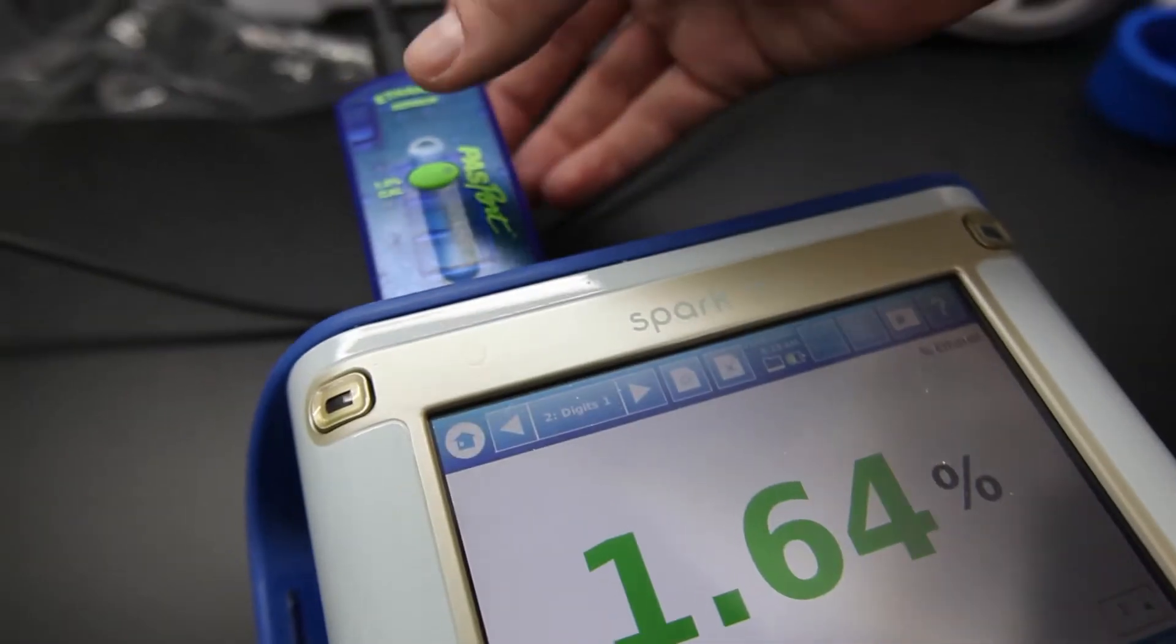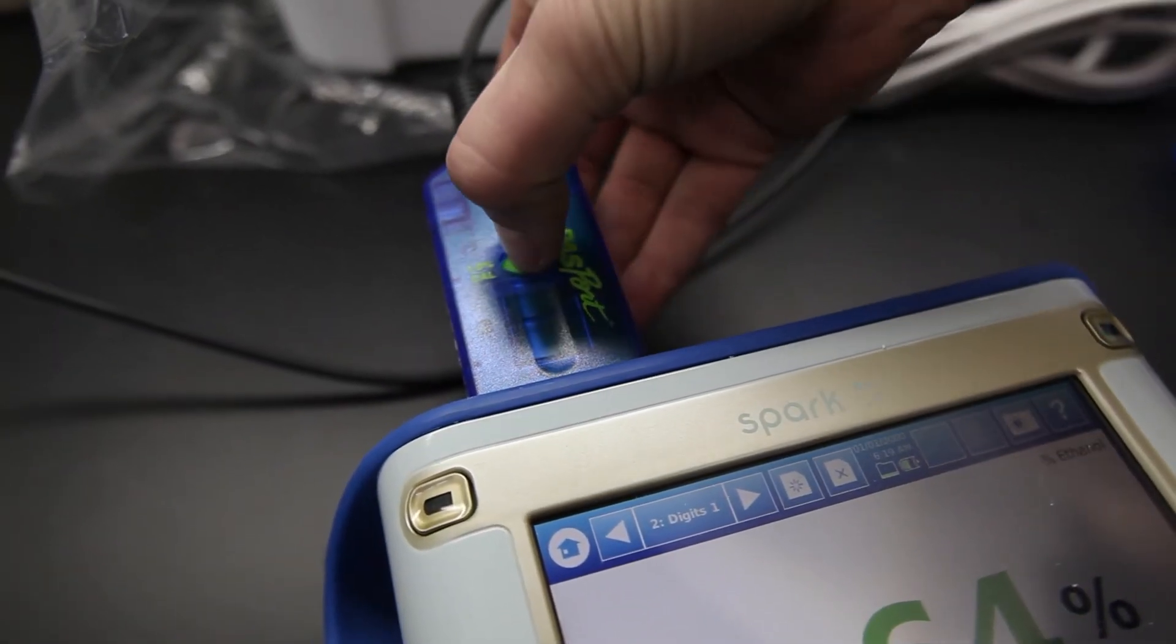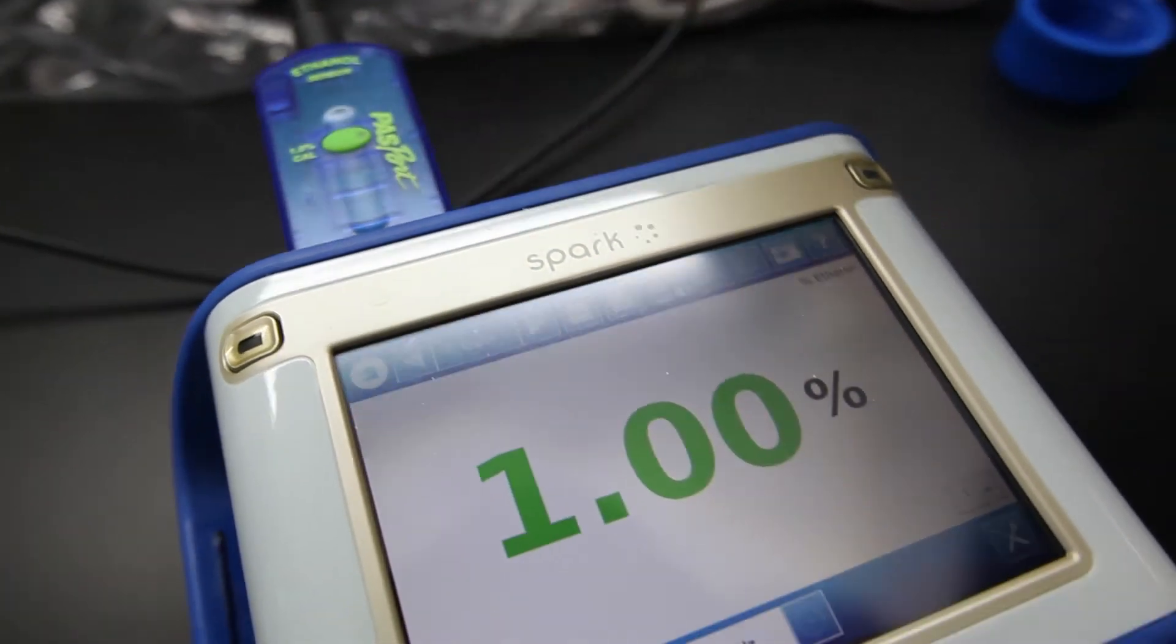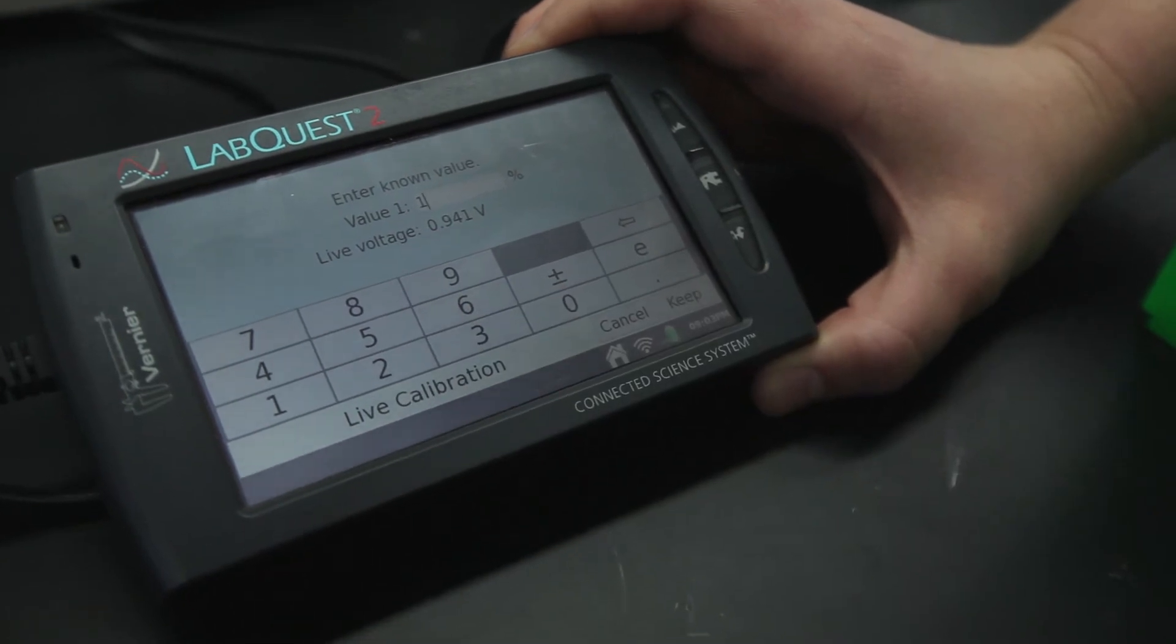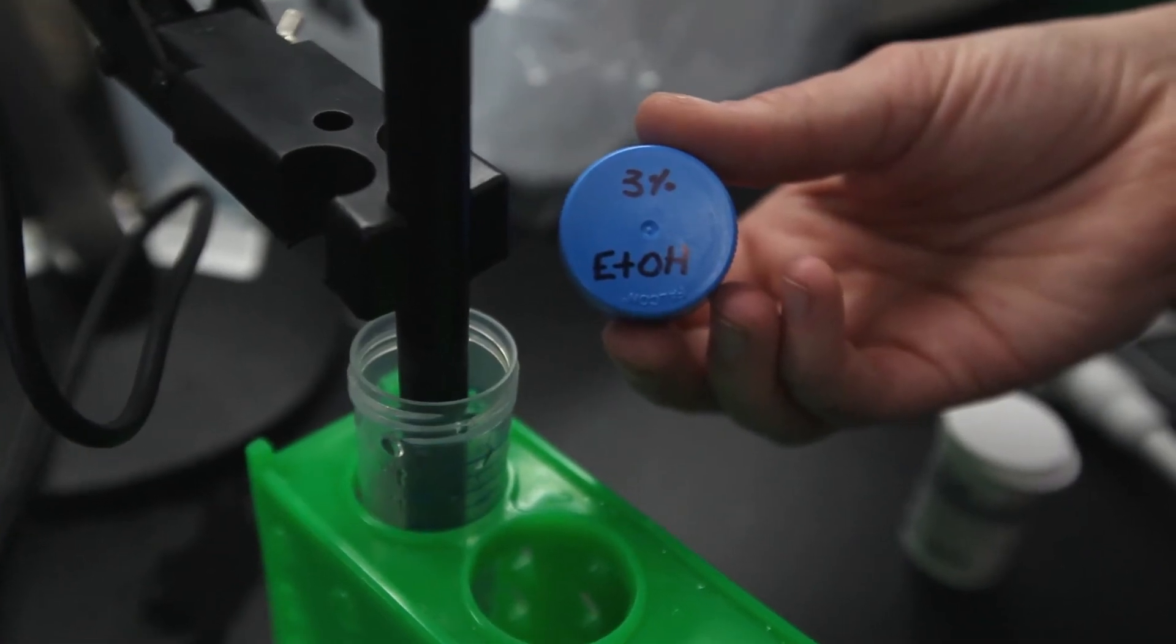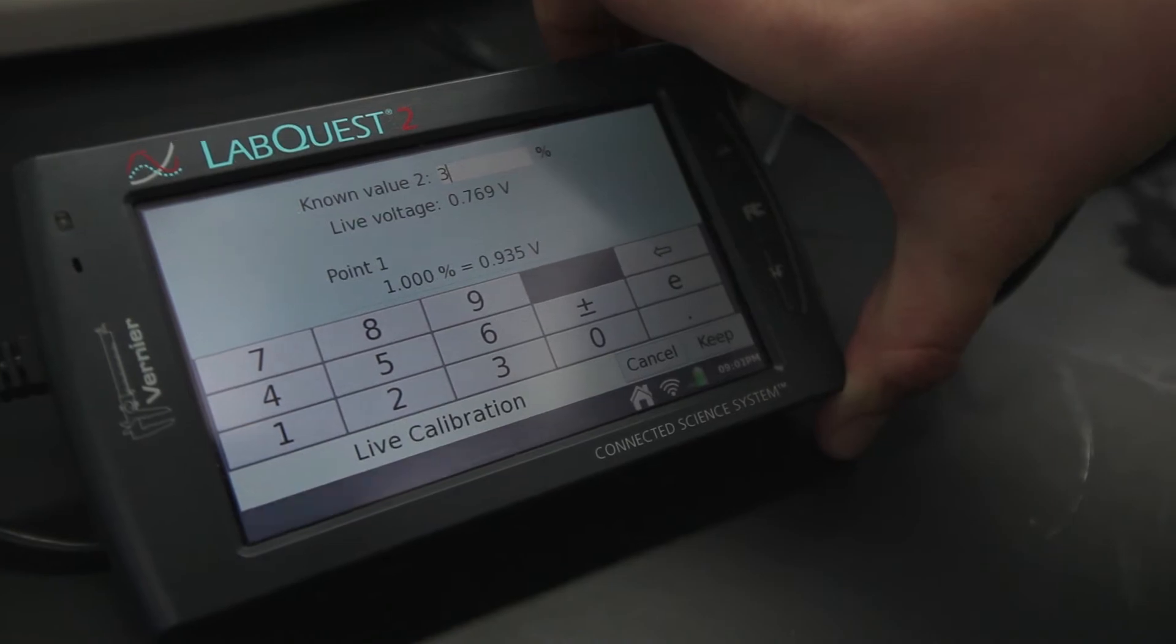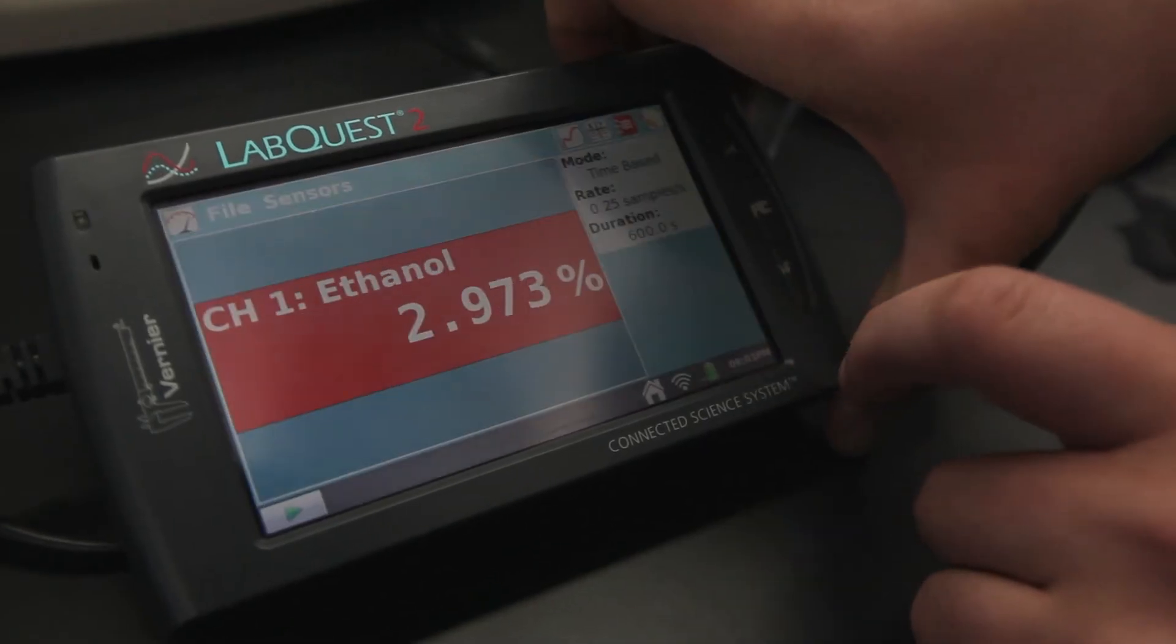For PASCO probes, use a one-point calibration with a prepared 1% ethanol solution. If you're using a Vernier probe, use a two-point calibration with either one-tenth and one-percent solutions, or one- and three-percent solutions. Match the calibration solution range with the expected range of your measurements.